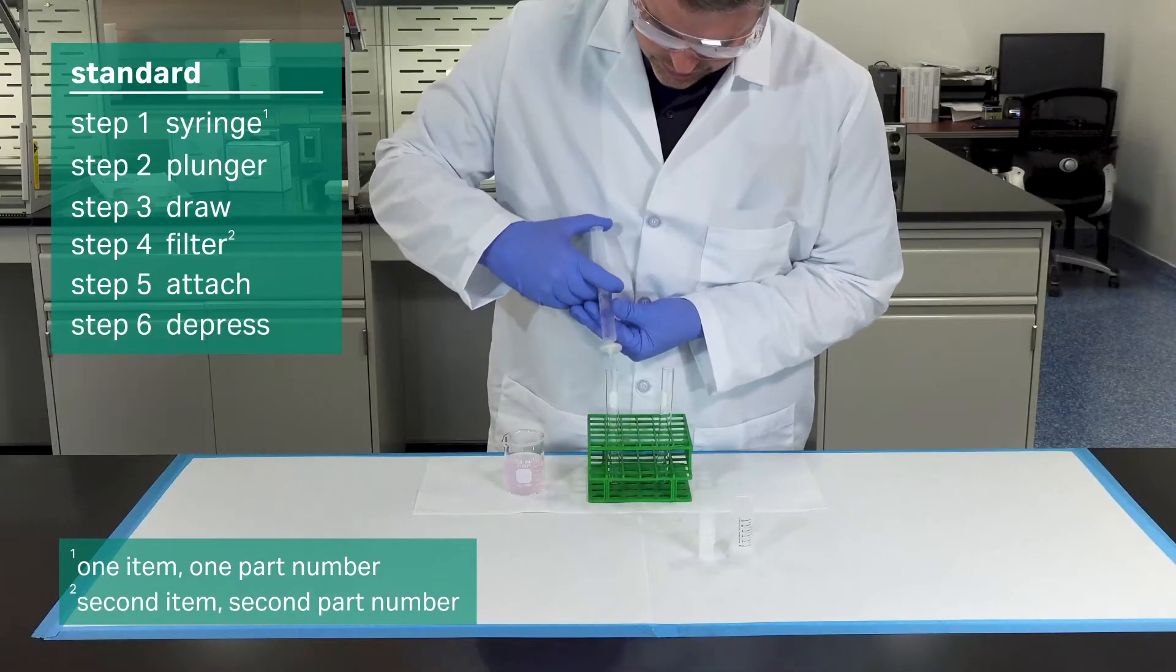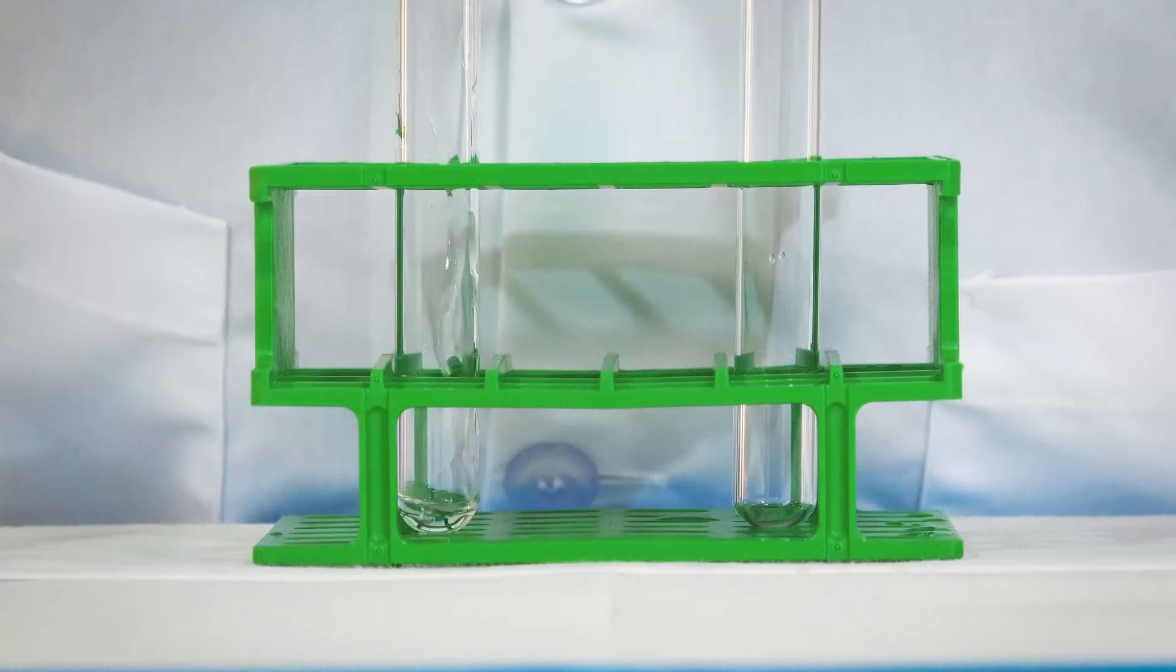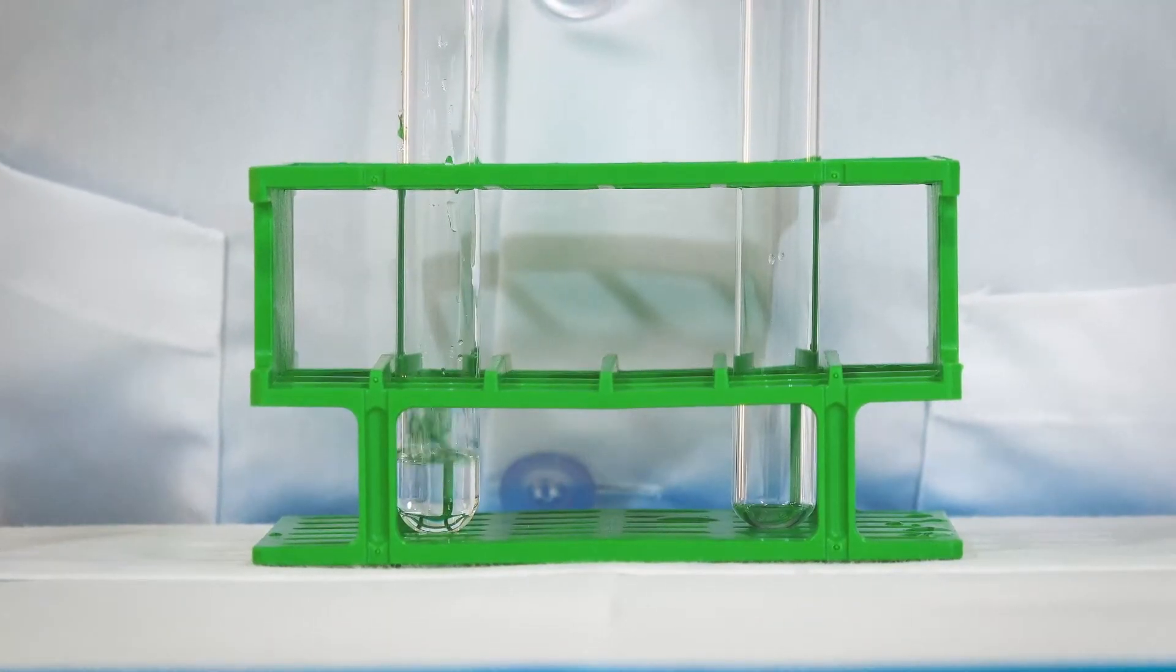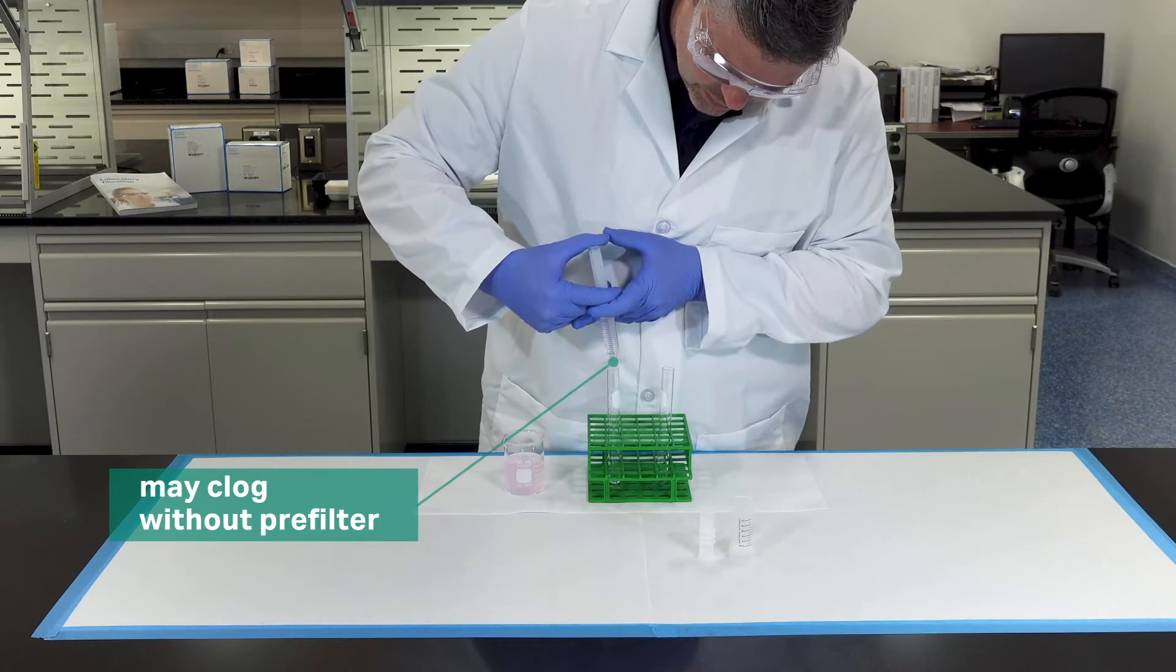Now depress your plunger, filtering your sample. Without a pre-filter, the standard syringe filter may clog as it does here.